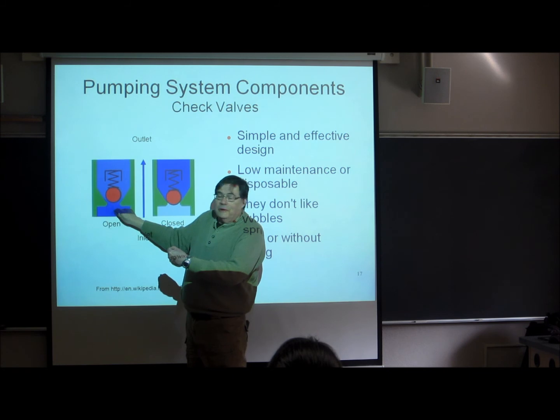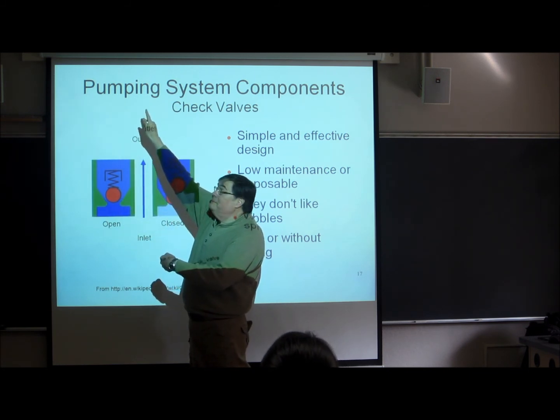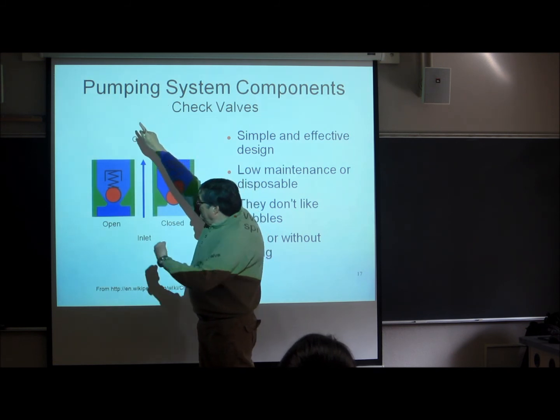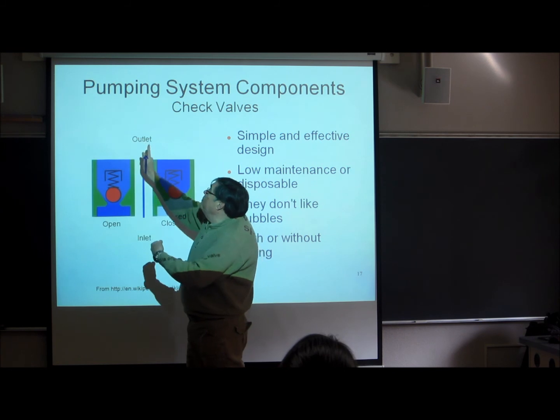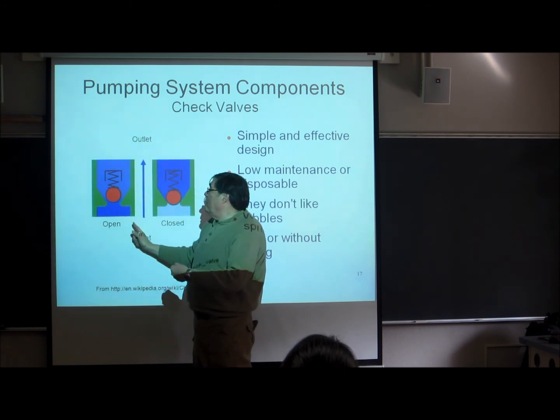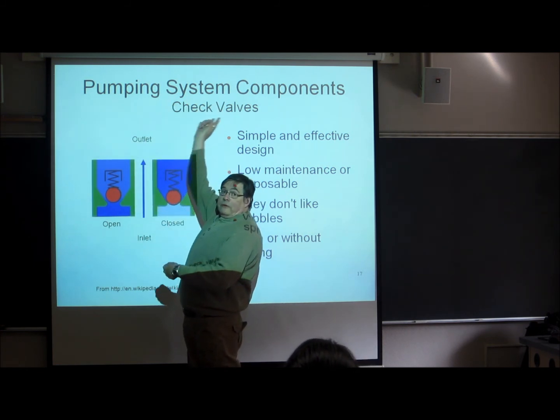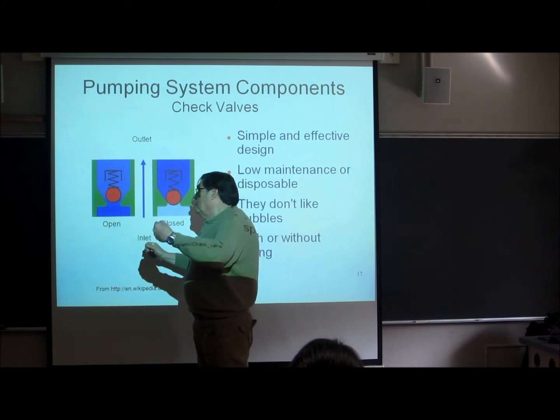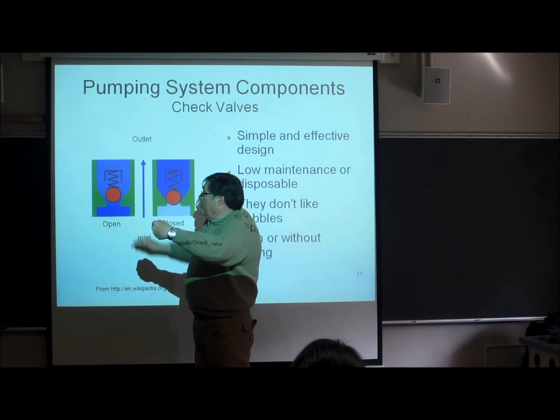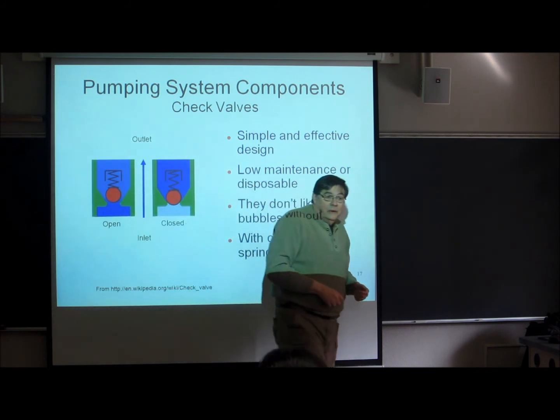Okay, not so difficult. Remember, there's another check valve up on the top, above it, up in the ceiling. And when we push on that to close this one up, that pushes the ball up on the one up above. So the balls work together to direct the flow through and over to the column. So when we push, it goes up. When we pull, that one closes, but this one opens up and it refills the piston chamber, okay?